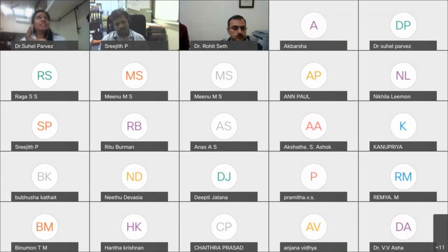And for fluorescence, we use different dyes like DAPI and propidium iodide for particular staining of the tissue. We clearly see what happened inside the cells. So we need high-end microscopy like confocal, or a microscope containing fluorescence filters, so we can easily differentiate what our tissue shows. The depth depends upon your experiment.